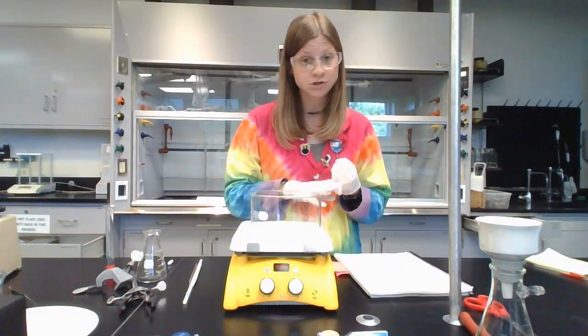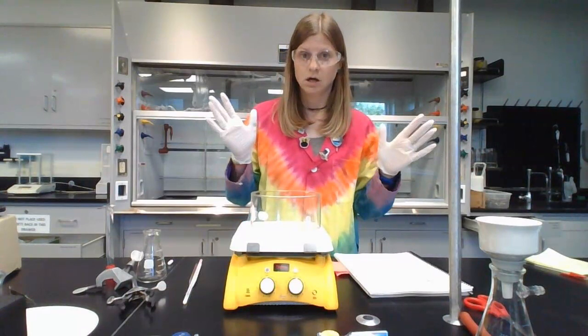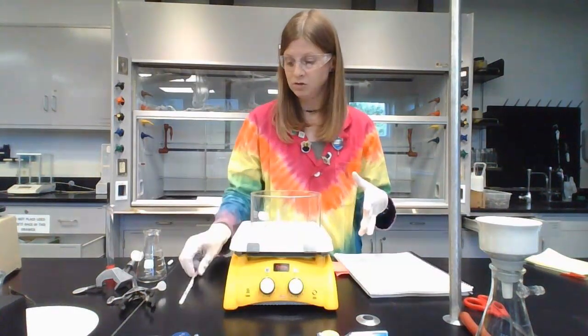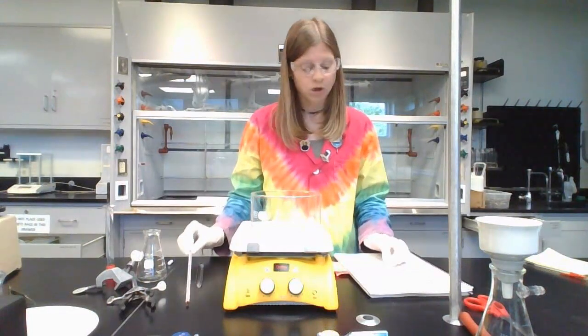Now we don't want it to boil, so we're not boiling it. It needs to be 80 to 90 degrees Celsius. So hot, but not boiling. While you get your water in there and get it starting to heat, you can use your thermometer to periodically check the temperature to see what's going on. We're going to start our reaction.